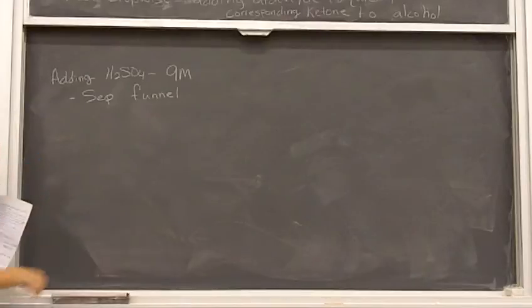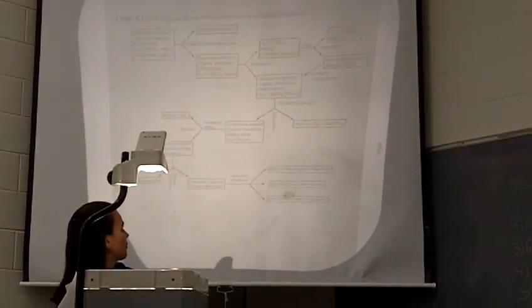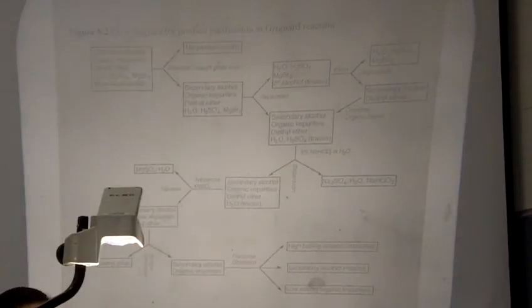And that is the quench of our reaction. So if you look in your lab manual, there's a flow diagram that shows you all of the workup of the experiment. Okay, so this part here is basically our big reaction mixture.